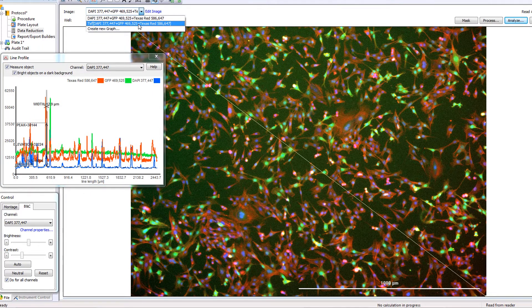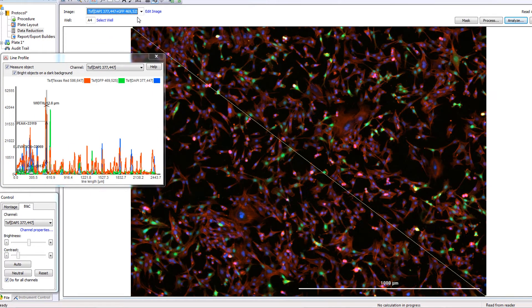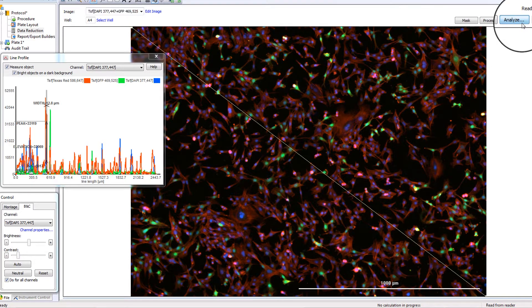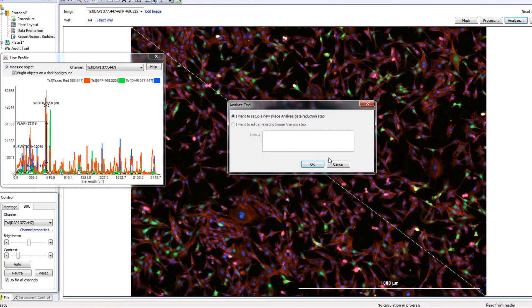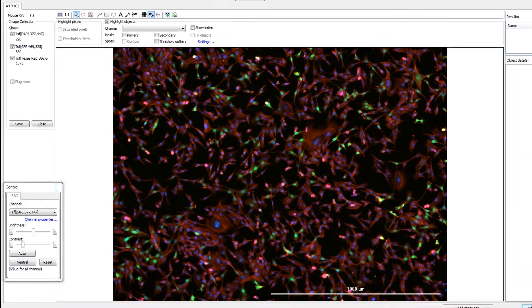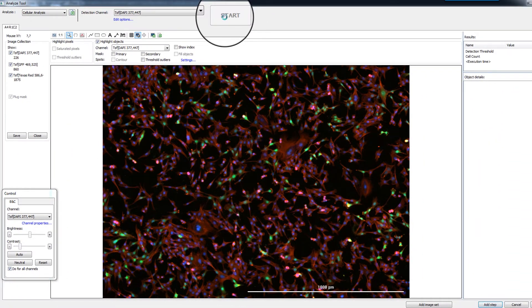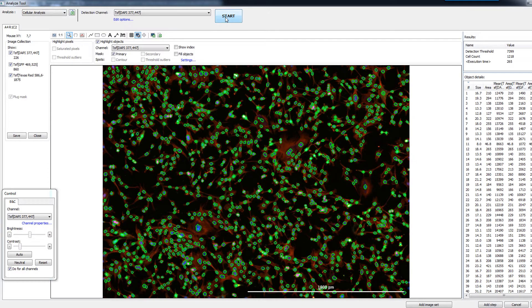Gen5's default cell counting settings are appropriate for most standard cell counting applications, including one-click cell counting that removes the complexity from image analysis.